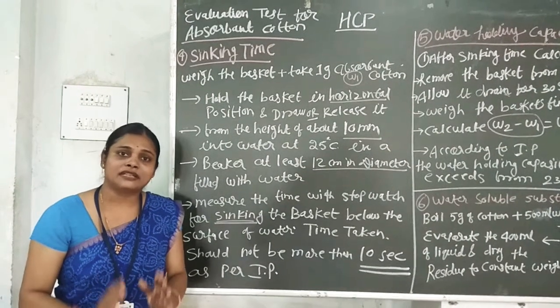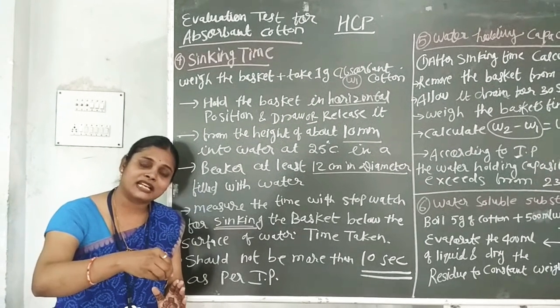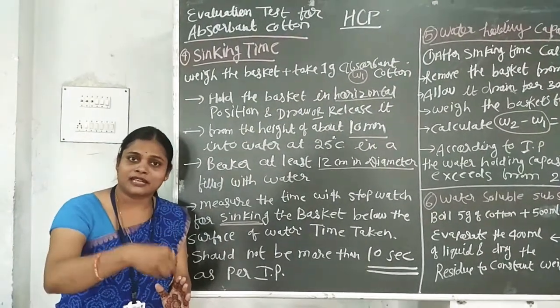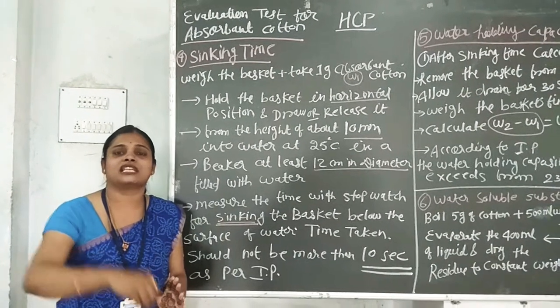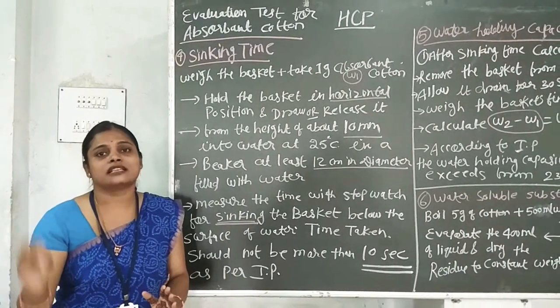After that, we fill the beaker with water. We keep the basket in a horizontal position. The water level should be at least 12 mm above the basket. We place the basket at the bottom. When we drop or release it into the water, we note the time — that is the sinking time.